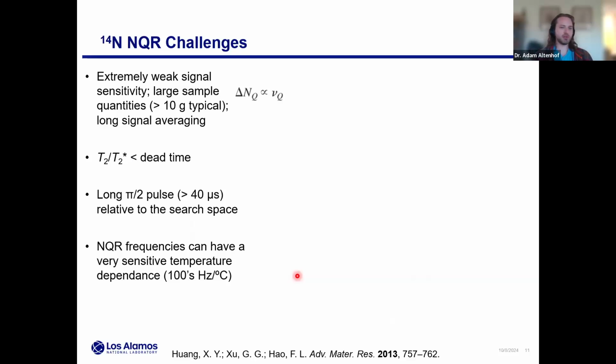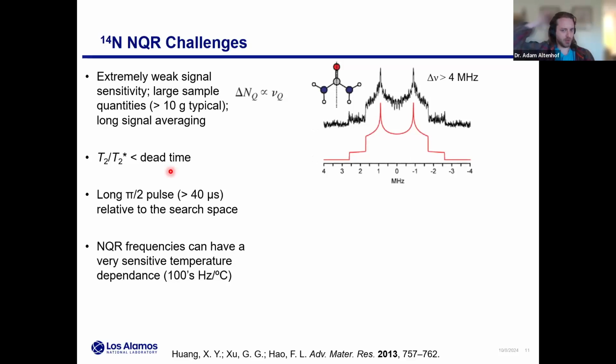Now, I'm sure some of you are familiar, the challenges associated with NQR are many. Signal sensitivity is incredibly weak: there's no magnetic field, relying just on the quadrupolar interaction, which is relatively weaker for 14N. So we get around this with the usual tricks: large sample volumes, long experimental times. We do have this extreme problem, certainly in 14N of small organics: the T2 could be really short. It could be the limiting factor on T2 star. If that's less than your dead time, you're never even going to see signal. And what I want to talk about a lot today is this sort of search for signal, if you will.